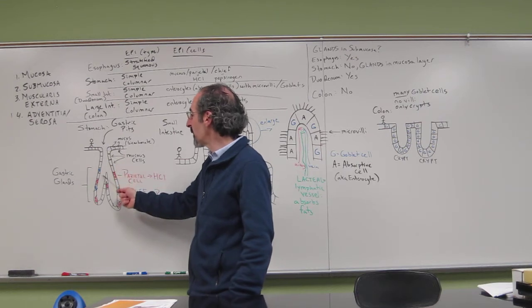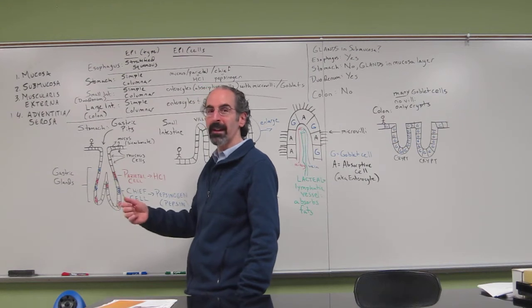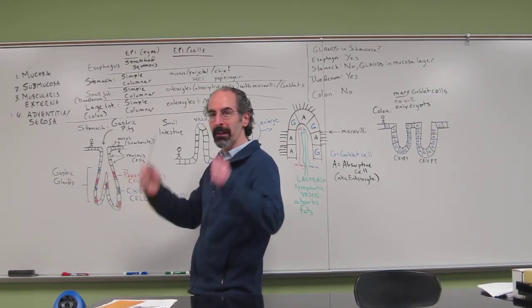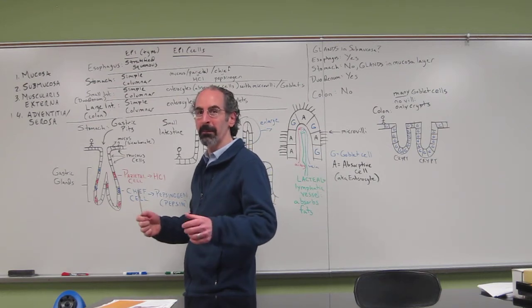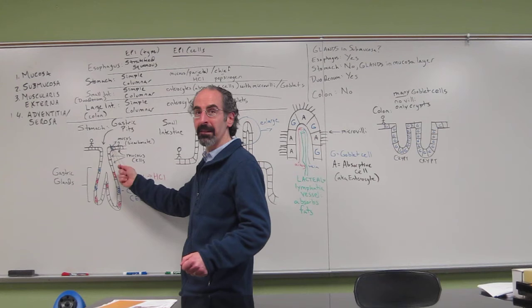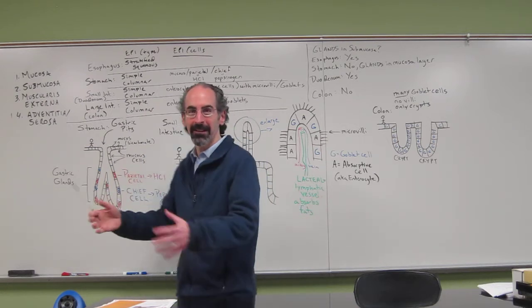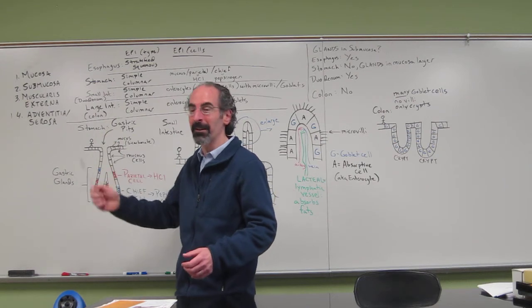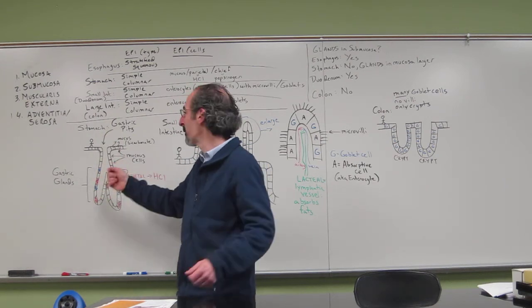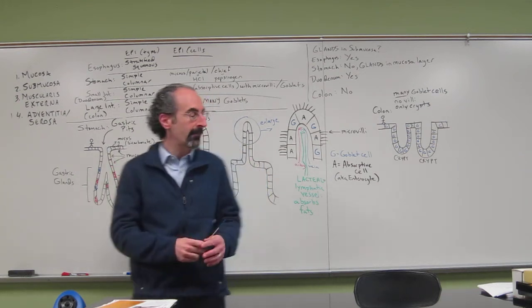This pit is rather deep and it contains gastric glands. It's deep, sort of like, you remember in the first Indiana Jones movie when Harrison Ford and Alfred Molina are trying to escape from that temple in the opening of the film, and then at some point they have to jump across this deep chasm, and first his buddy goes, and then Harrison Ford says, "Throw me the whip," and the other guy says, "Throw me the idol." So he throws him the idol, and Molina says, "Adios, amigo," and Harrison Ford jumps. Remember all that? This is that sort of situation that you would encounter here.